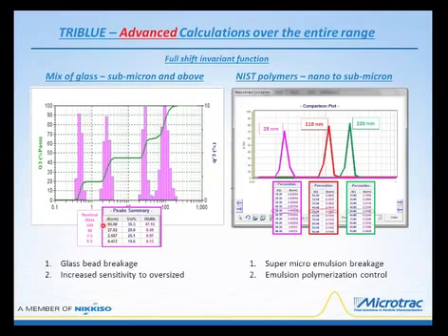But you can even see here, as we go down these sizes, this is peak summary data that's calculated by the Microtrac. It shows the 4 peaks and the various sizes that are present. Now, the nice thing about this is that if you have large particles and you're worried about those nice spherical particles fracturing in any way, you will have the sensitivity to see those fracturing events, and maintain control over the handling of the material or any other part of the process that can bring about the fracturing of those particles.